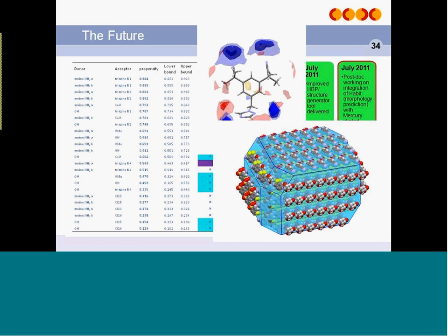Another area that we're working on at the moment is morphology prediction. So we have a collaboration with the Institute of Particle Science and Engineering up at Leeds University, where we're including attachment energies into our morphology calculations. And we're really hoping this opens the door on us being able to interact with surfaces of particles or models of surfaces of particles in a really nice way, perhaps using some of our tools so we can look at and perhaps predict impurity interactions or inhibitory interactions of those surfaces.